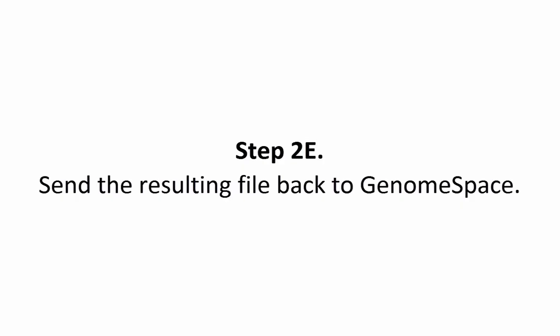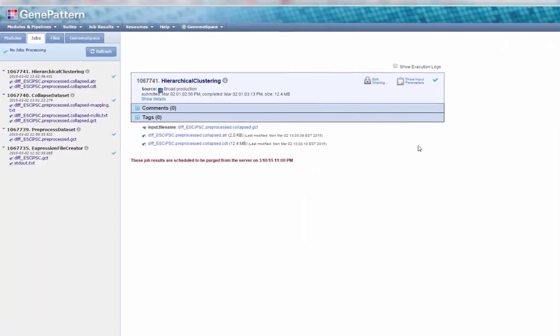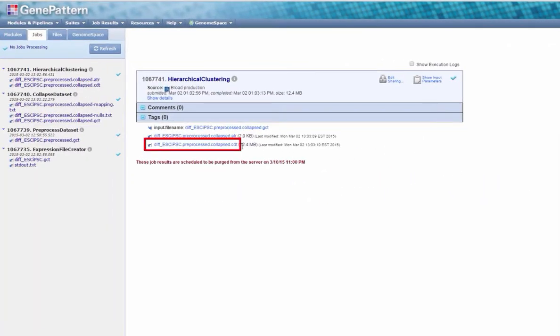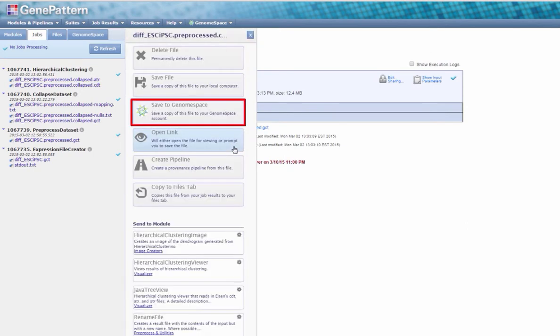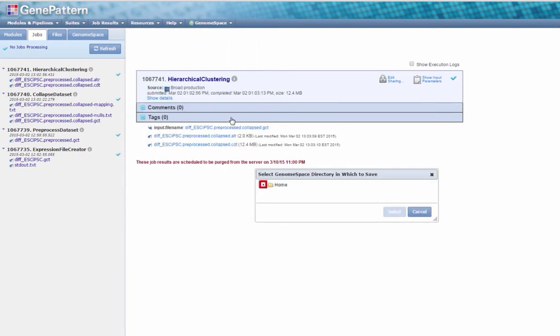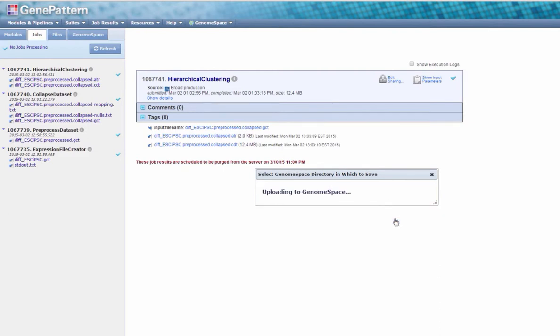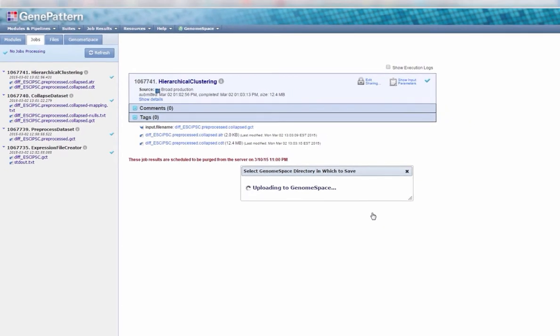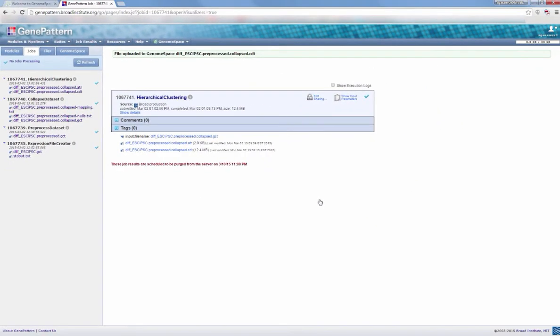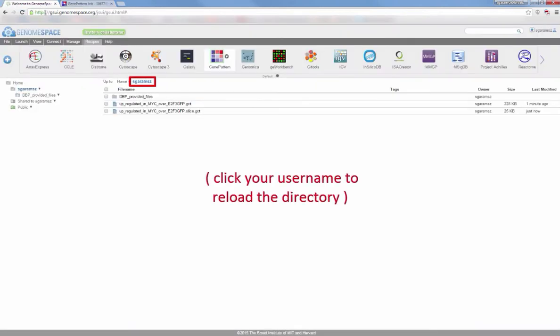Step 2e. Next, send the resulting file back to GenomeSpace. Click the file outputted from your previous job, diff-esc-ipsc.preprocessed.collapsed.cdt, and choose Save to GenomeSpace from the slide-out menu. Choose a directory in which to save the file, and click Select. Return to GenomeSpace and click the directory to refresh it and view your file.